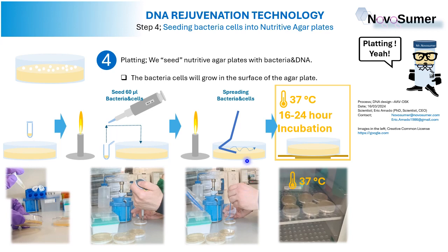Well, once we have all the bacteria cells nicely spread over the surface, the only thing that we have to do is incubate these agar plates in an incubation chamber. Do you remember the incubation chamber? This incubation chamber does not have agitation.